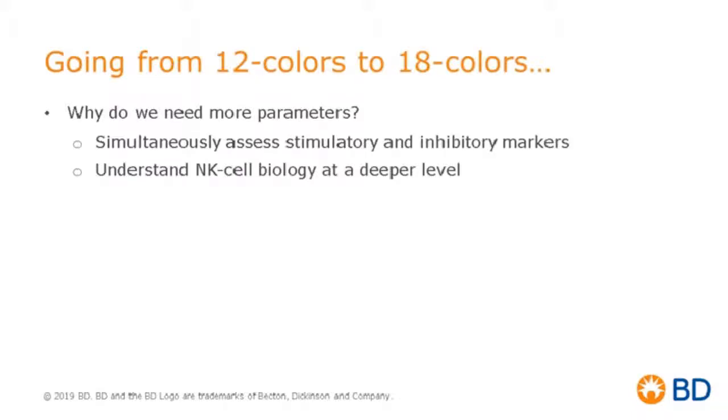However, the challenge of going from 12 colors to 18 colors is linked to panel design and the difficulty of designing a panel with more markers.